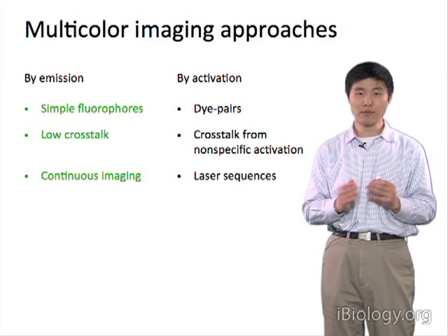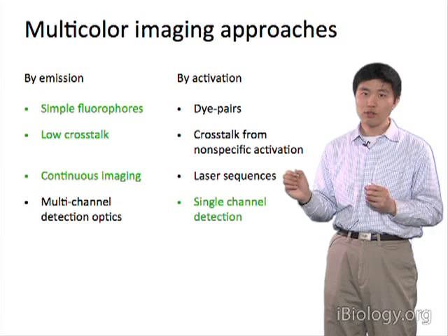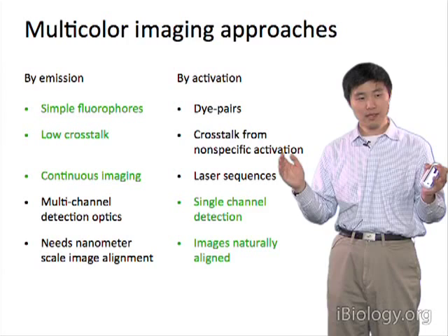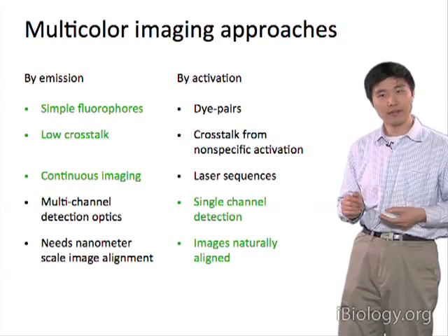As for the advantage of the activation wavelength method, first, for different channels, you are simply imaging exactly the same color. That simplifies the detection optics, and there's no image alignment required. For the different emission wavelength method, compensating for the chromatic aberration up to nanometer precision is not a really easy task.